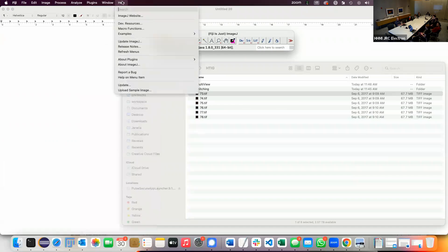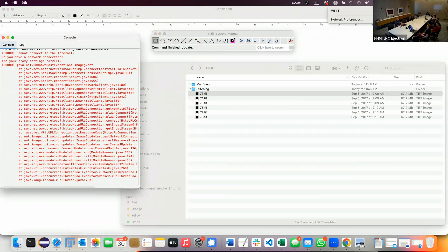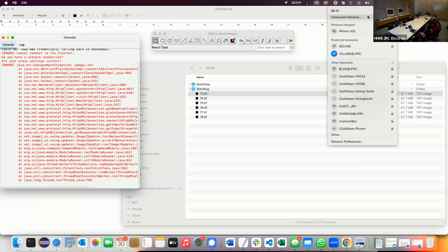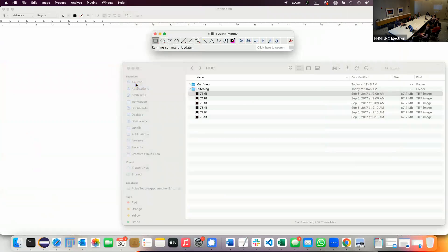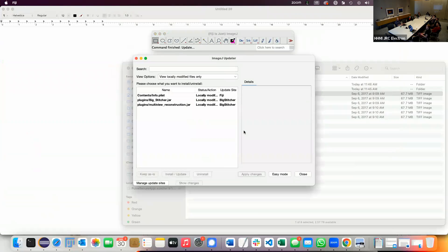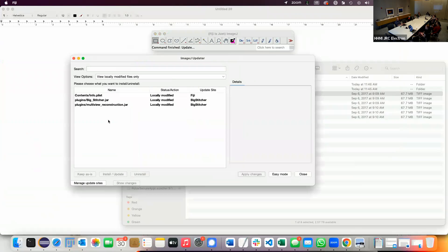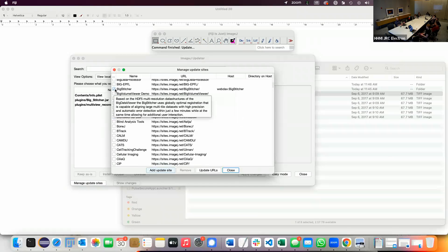If you don't have BigStitcher installed, you go to Help > Update. You click on Manage Update Sites and activate the BigStitcher one. That's all you need to do — it asks you to install these plugins, and then you restart Fiji and it's there.